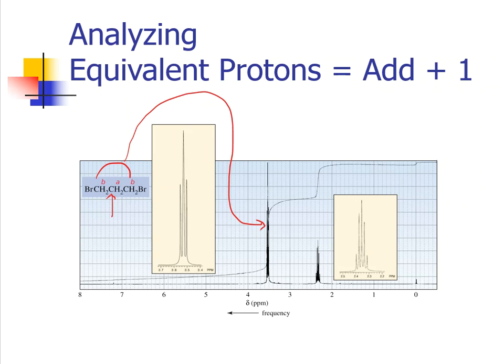So if I look at this, this is a signal that we're getting next door to that carbon. We have two hydrogens, and those two hydrogens there, they are 2 + 1, which is going to be a 3, right? And if we zoom in on that signal, we actually see that triplet take place. So that one makes sense for us, right? So that one we feel good about. It makes sense as far as the lecture material goes. It goes hand in hand. There's no really funny things that are happening here.